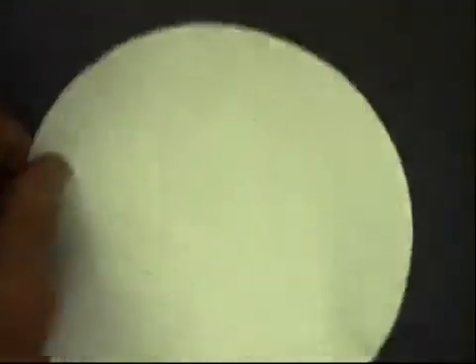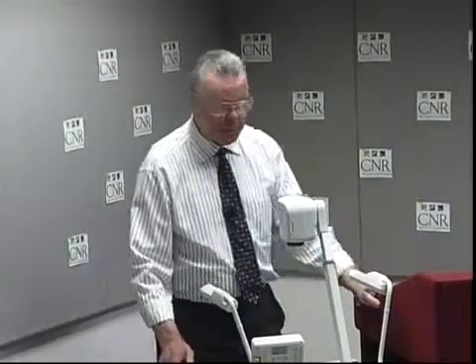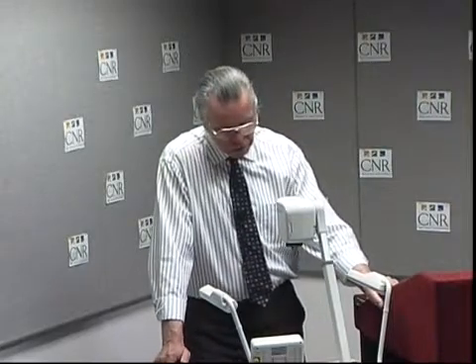But we will show you a wet technique that will be used, or should be used, in process control, which brings me back again to the subject that the TAPPI 563 is a way of quantifying the amount of dirt that is in the stock or in the bale that is shipped to a mill that is not integrated and is interested in quantifying the quality of the stock that they are buying.